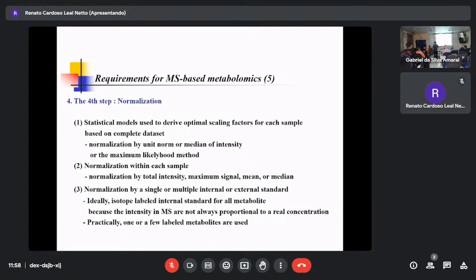Then for the same sample, the 10 microliter signal is very high if you do not consider normalization. Fortunately, I added the same internal standard, same height. Then all the signals divided by the internal standard can be comparable. That's the internal standard normalization, right?